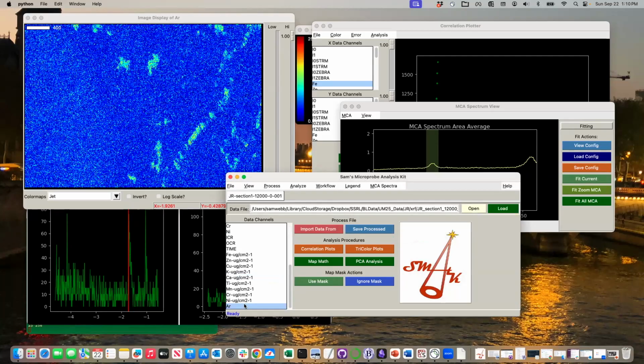I haven't made the name generic because I started out with X-ray data. MCA is kind of our full spectrum information. But generally now, any of the hypercube data that you're going to work with, whether it's mass spectrum, infrared, UV visible, all goes through this MCA spectrum viewer. A lot of the principles are all the same. We can load the data in and do all these things with it. If we get down to some of the multimodal aspects, we'll show some of that today as well.